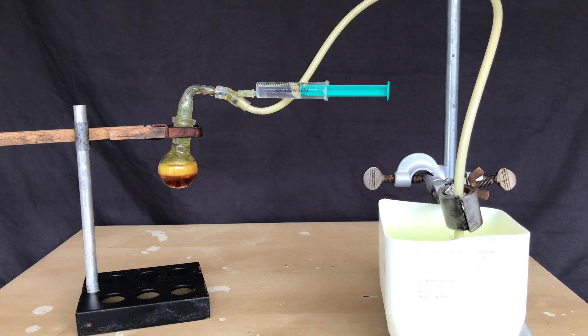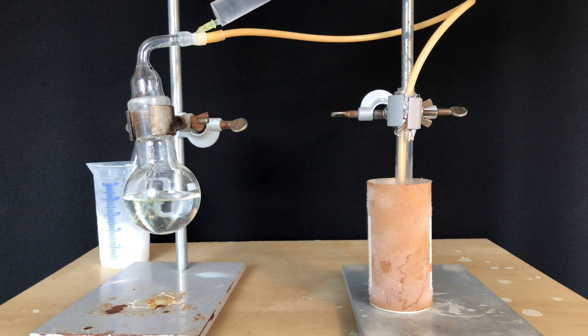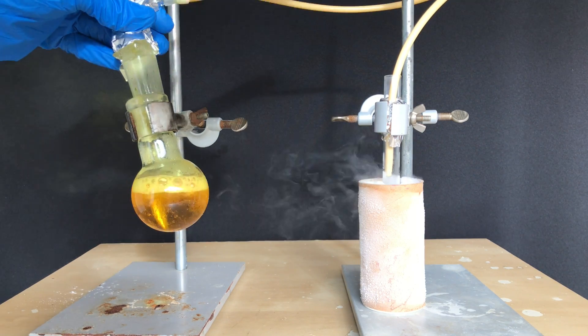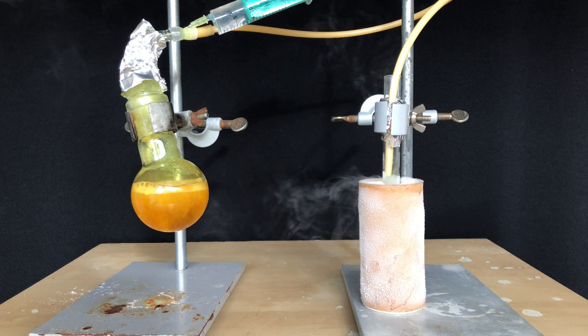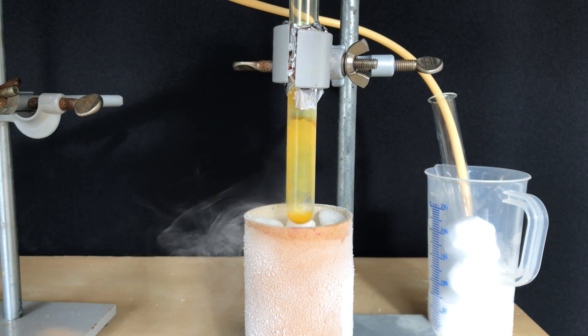A mixture of ice and salt is just not cold enough, so I got some dry ice. I set up another apparatus and produced even more chlorine dioxide. The amount of sodium chlorite added initially was not enough, so I opened up the apparatus, added more, closed it back up, and let it run. In the end we were left with a yellow solid.